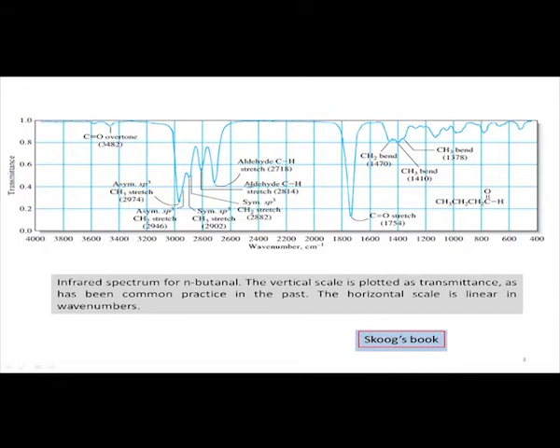So, the other one will also be available over here, and which one is more characteristic for this function is that, as I told you, if you have a corresponding carbonyl function for acetone, or the corresponding CO function for acid, or any other case, we have a very characteristic one at 1754 centimeter inverse.